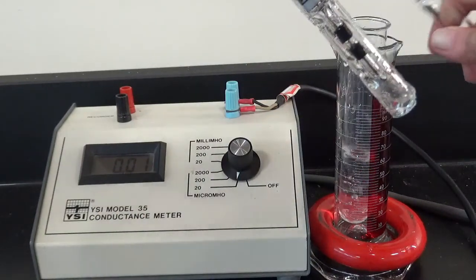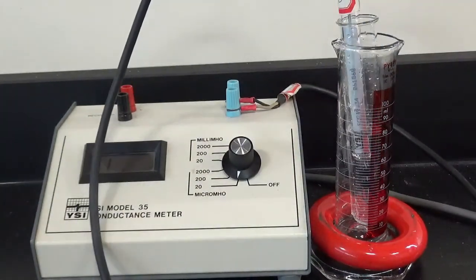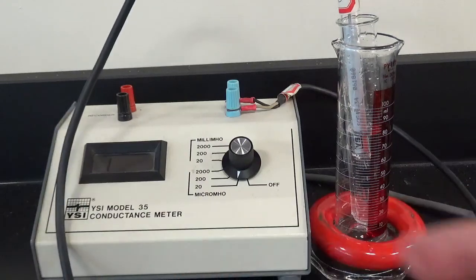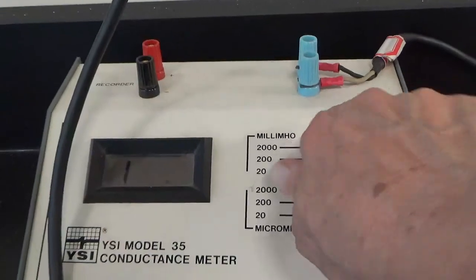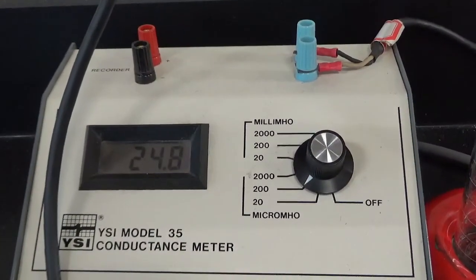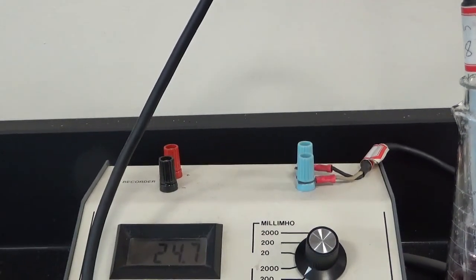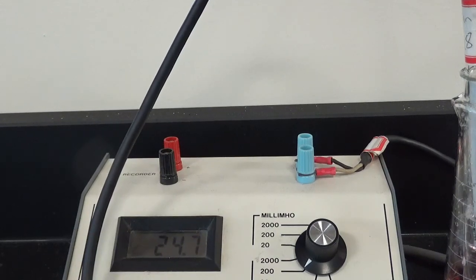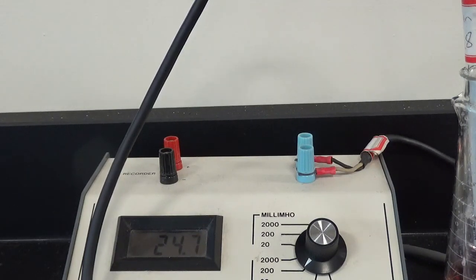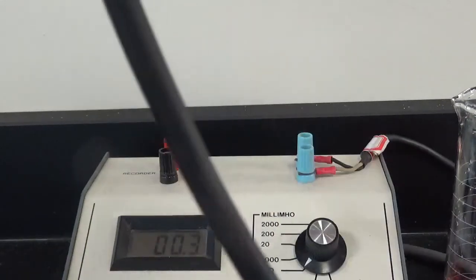I want to leave enough left so I can do my fluorescence measurements. All right, now let's see. You see now that 1 on there, that indicates that I need to go up to the next range. So this is 24.8. It's still micromo. Okay, I'm going to rinse that, get rid of that.